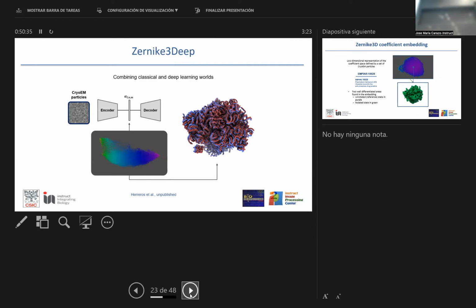So my next question is, our group is very interested in uncovering protein dynamics. And what we've found is that if you re-prepare specimens from scratch and then redo the imaging again, so actual biological repeats, not technical.